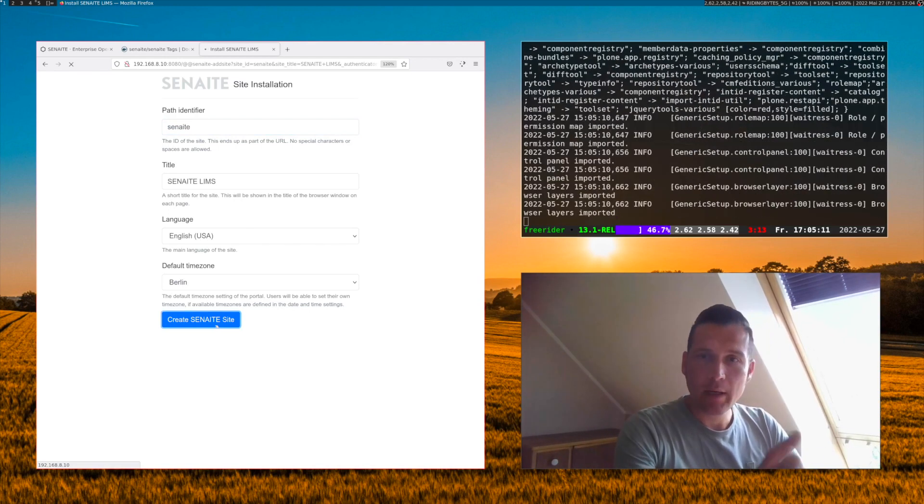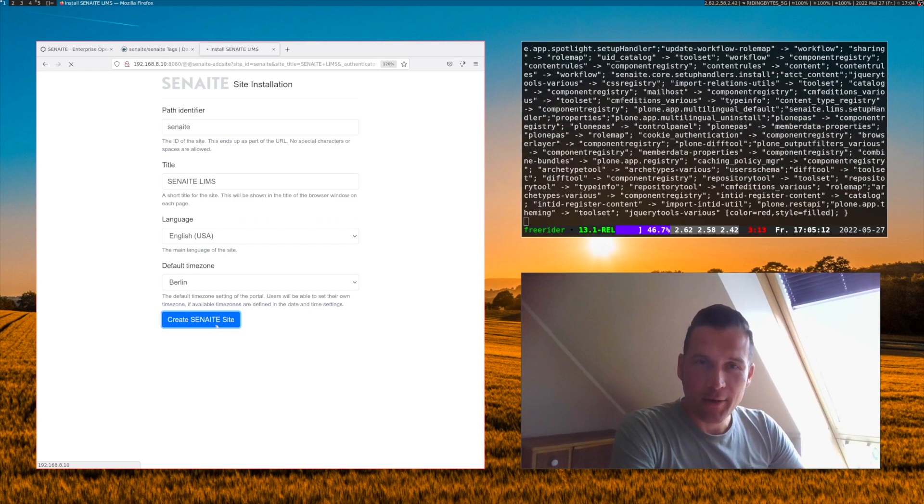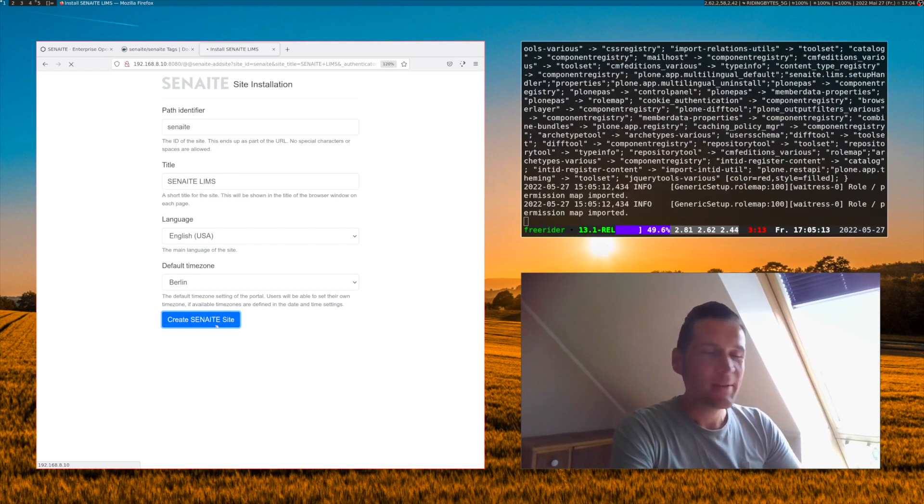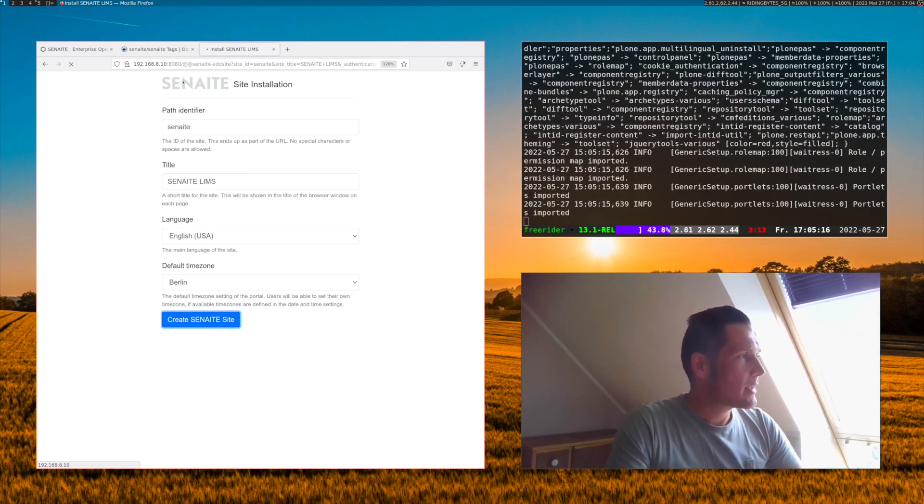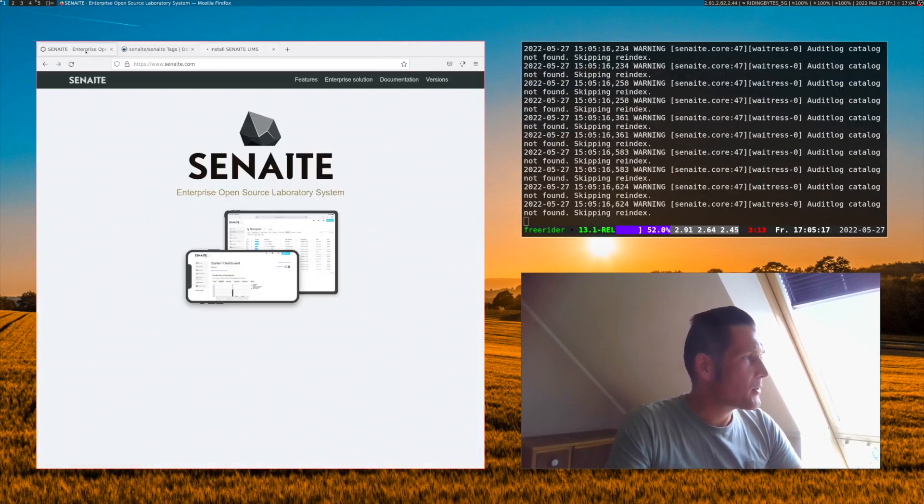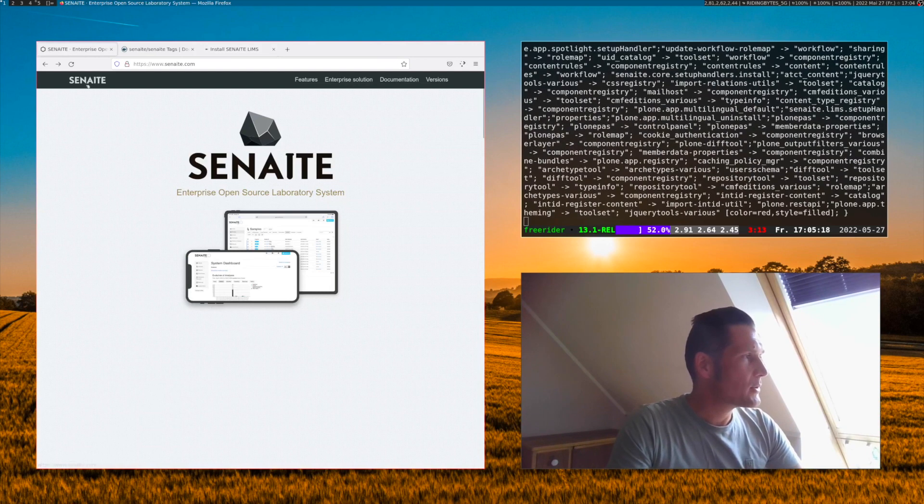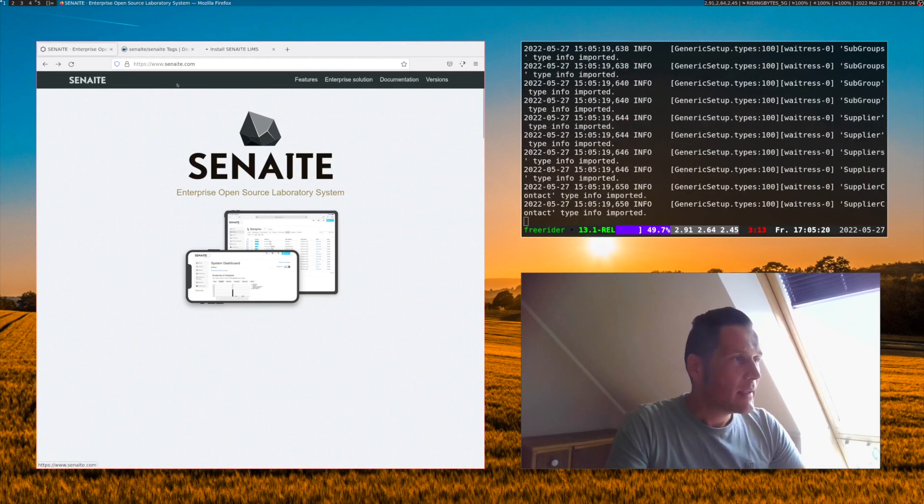You see already in the background a lot of things happen and we can use this as an opportunity to go quickly to the Senn8.com website.